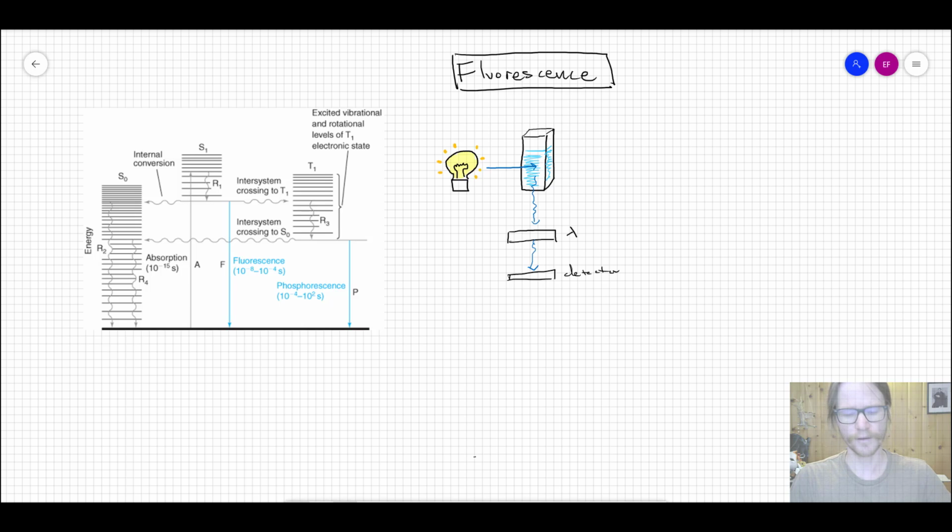So the nature of the fluorescence and phosphorescence process changes the way that we think about measuring them for the better, in that it actually gives us an edge on measuring emission of photons compared with simply measuring absorbance. So what I have is a really simplified version of an instrument diagram for a fluorescence measurement, where you have your lamp, some broadband source, and that actually is in direct line with your sample and blank cuvette.